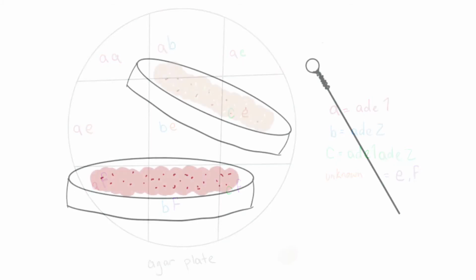The next step is to mix our yeast. I obtained each strain of yeast, and for each one, I used a sterile loop to scoop out a colony of yeast from the culture and placed it into the correctly labeled spot on my labeled agar plate.